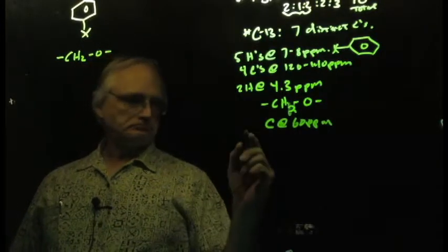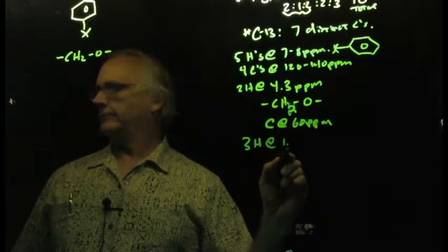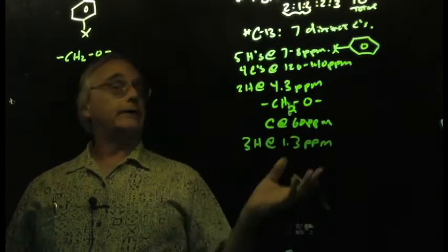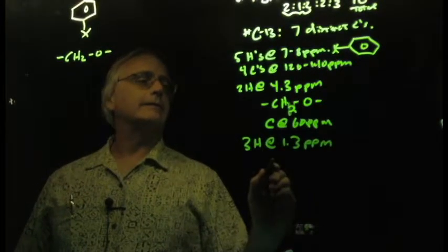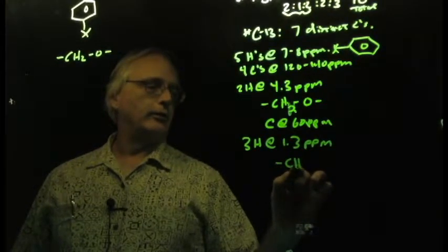And then I see 3 hydrogens at 1.3 ppm. Okay? Now, 3 hydrogens at 1.3. It can't scream much louder, that has got to be a methyl group.